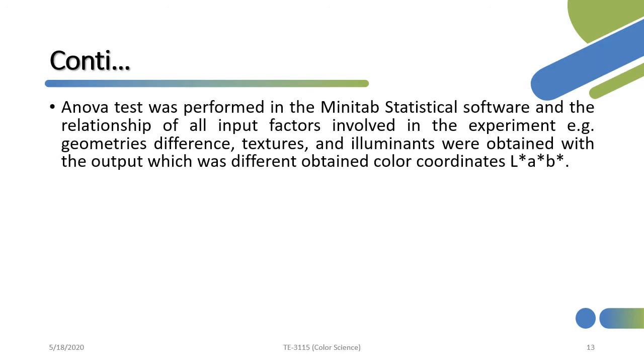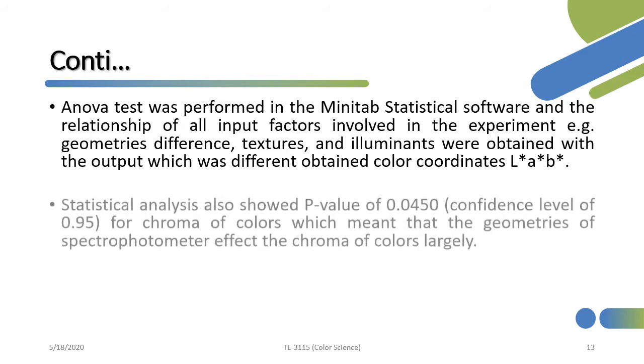After the comparison of results, another test was performed in the Minitab statistical software, and the relationship between all the involved input factors, which were geometry difference, textures, and illuminants, and the output factors, which were the L, a and b values of samples, was obtained.